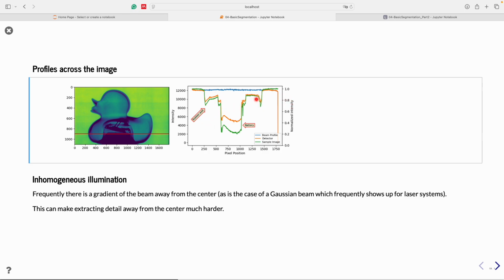First, you have the beam profile that behaves a little bit differently, and you see this little tilt here. That's actually a scattering effect from the sample. It's also a physical effect that you may have to correct for later. So it gives you some kind of glowing halo around the object. So when you normalize, you get the, say, correct profile. It's flat outside, ideally. And that is what we're going to work with later.